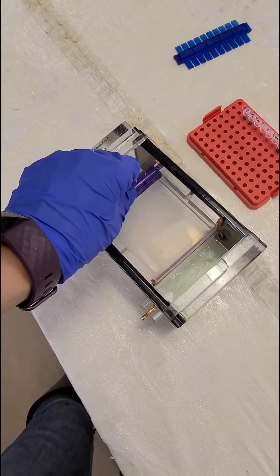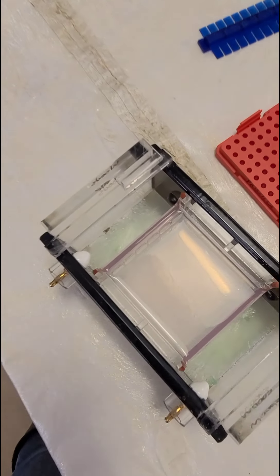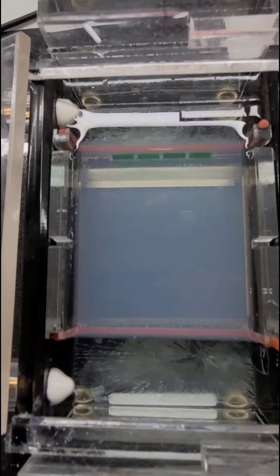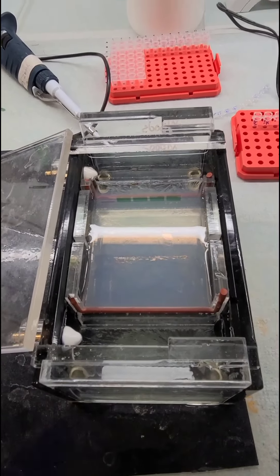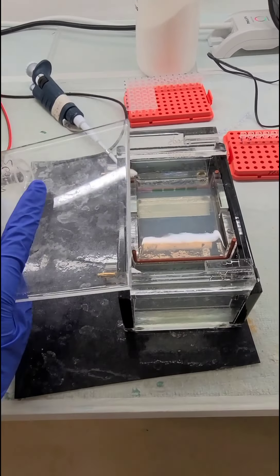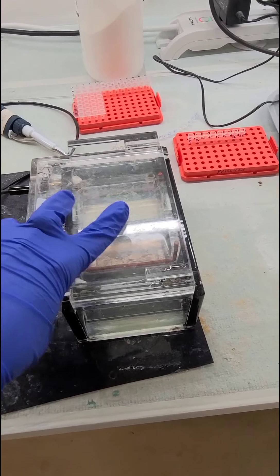So instead of doing a typical 20 microliter reaction, we do one for 50. It's then the same PCR protocol — you run the gel from black to red and add the 50 microliters to each well, add your ladders and let it run, and hopefully get clear bands that we can then extract.